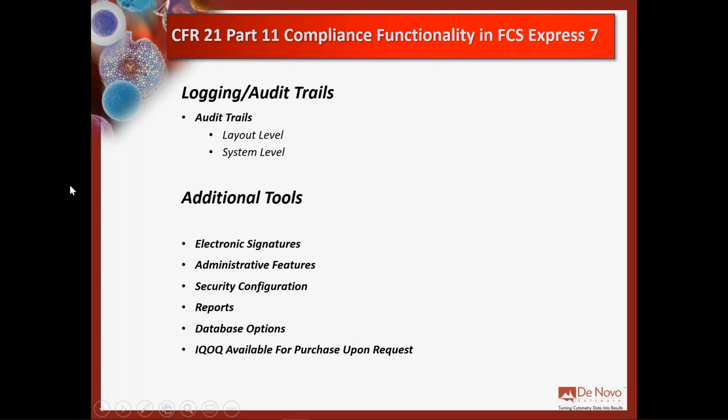So with the audit trails, again, these are pretty self-explanatory. The audit trails will recover and show you every single action that was performed on an analysis, and who it was performed by. They'll do that at the layout level. So if you move a gate, you get the before and the after of those gating positions of every action that you perform. But we also monitor at the system level with these new system level audit trails that were added to FCS Express in just the last few months here. And what that allows you to do is see which users have been created. You can see if somebody's printed something out but not saved the layout, right? Kind of an important compliance gap there.